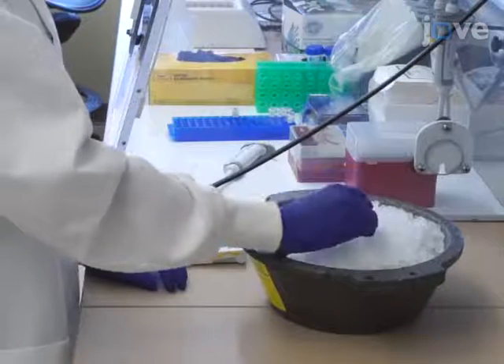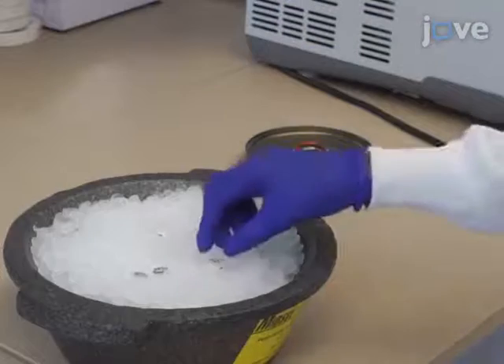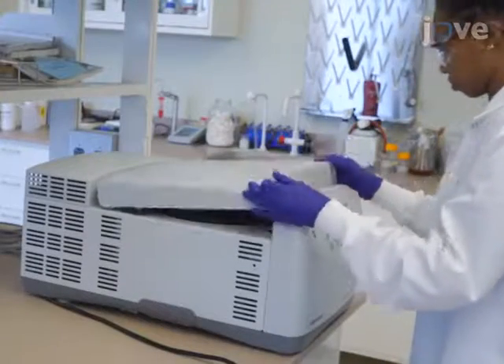Next, incubate the sample on ice for 15 minutes. After incubation, centrifuge the sample for 15 minutes at 20,800 G and 4 degrees Celsius.